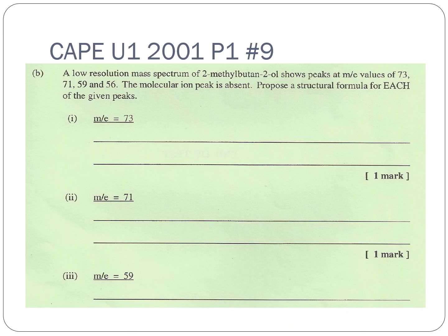This is also telling you that this could be a branched chain structure, and we know that it is 2-methylbutan-2-ol. And because it is a branched chain structure, we will not likely see any peak at the far right because the relative abundance of the base peak is so high in comparison.